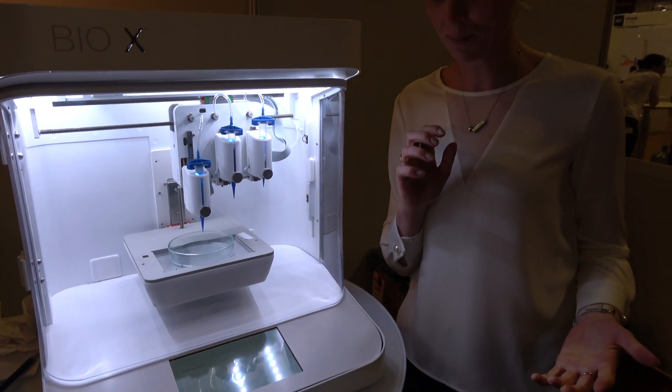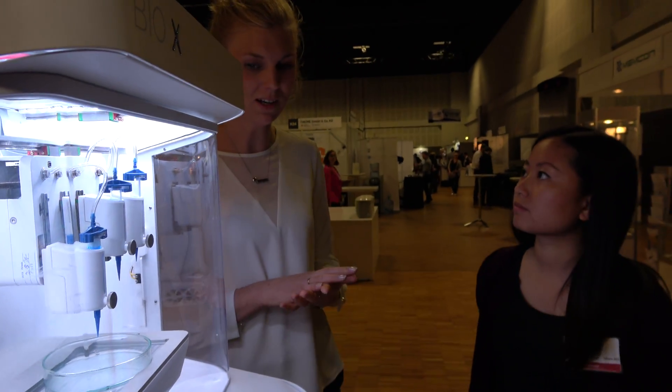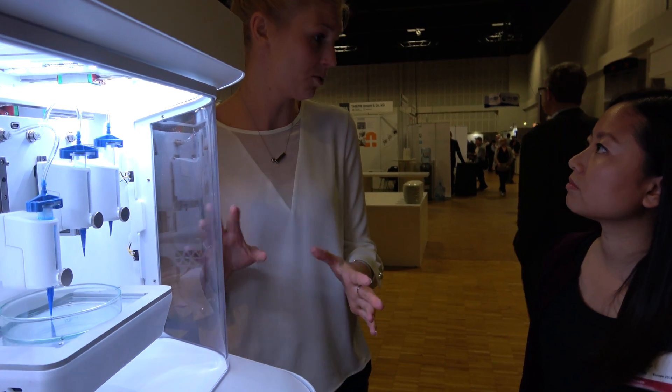The process is very easy. The idea with the printer is that anybody should be able to use it. Even if you haven't worked with 3D printing before, it should still be possible to use the printer.